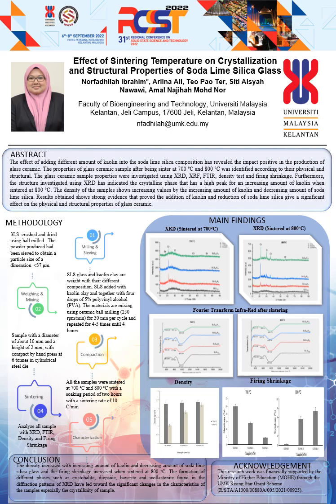Meanwhile, for the method that we use in this research, the first step is milling and sieving. In this step, the soda lime silica glass is crushed and dried using a ball mill, and then the powder produced needs to be sieved to obtain particle size lower than 37 microns.